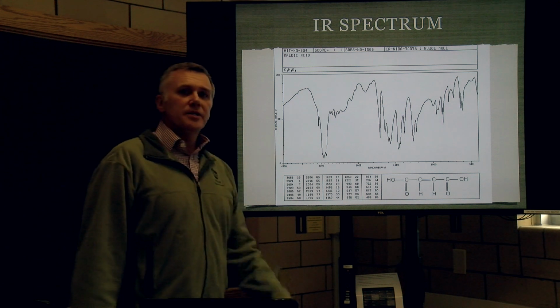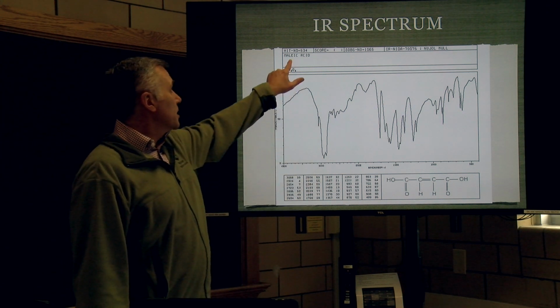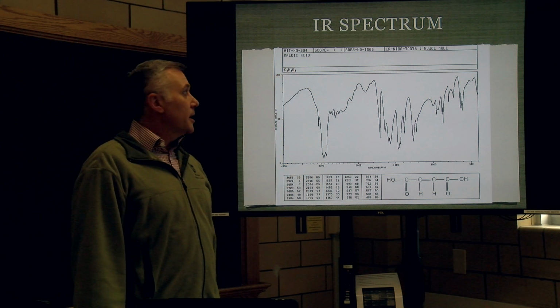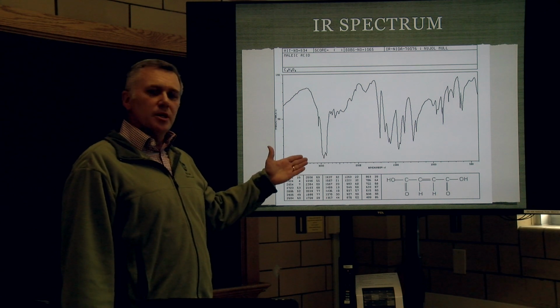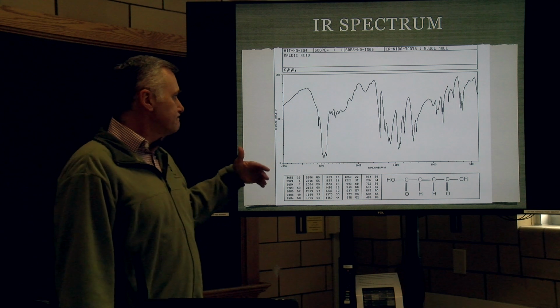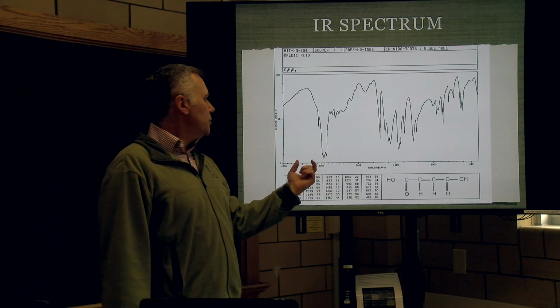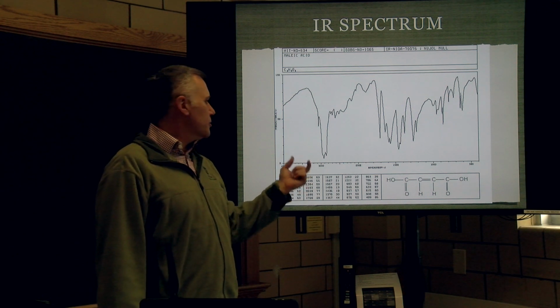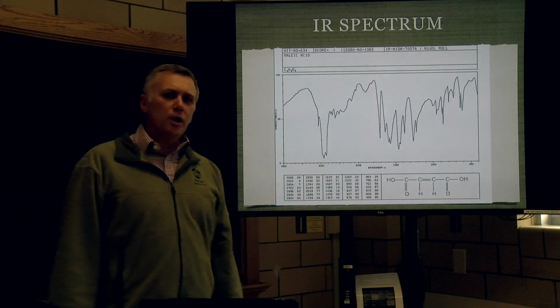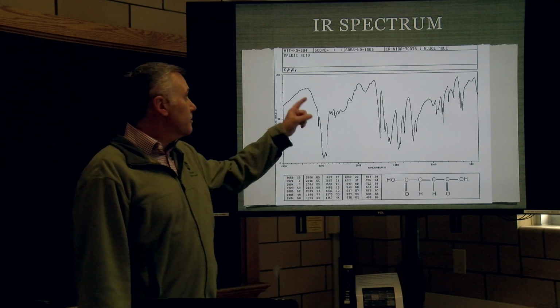One of the things that we're going to end up with after we do the experiment is the IR spectrum. And this is for maleic acid. You're also going to get it for fumaric acid, and these are the ones shown in the lab manual, but we're also going to gather some in the laboratory too. As you interpret this, one of the things that you want to do is use our 5-zone method. So look at zone 1 and then 2, 3, 4, and 5, and use that to help drive your observation of where these peaks absorb.